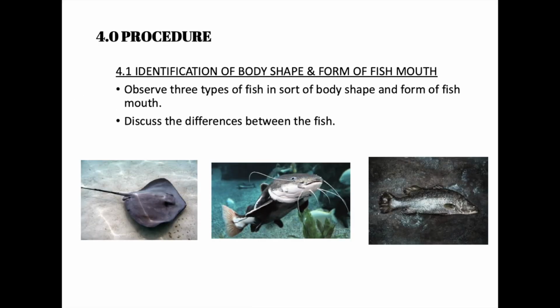4.0 Procedure. 4.1 Identification of body shape and form of fish mouth. Observe 3 types of fish and sort the body shape and form of fish mouth. Discuss the difference between the fish.